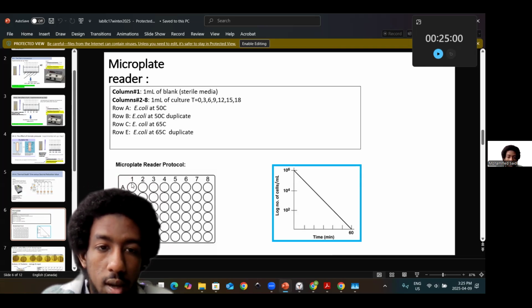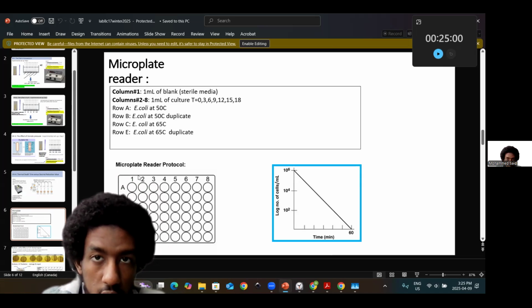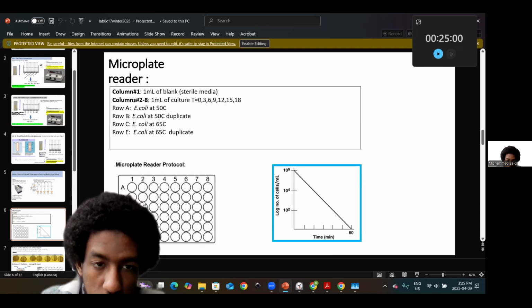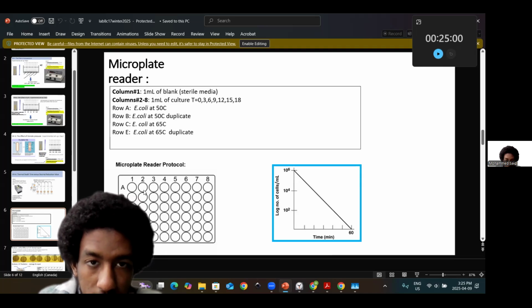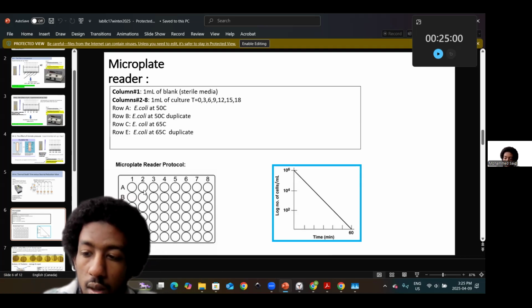But the important point is that from column 2 onwards, there were inoculations that repeated every 3 to 4 minutes. And I say every 3 to 4 because this was 5 minutes for many of you guys. Actually, let me just go forward with the understanding that for each column, imagine this: the flasks are either in the water baths or being taken out.